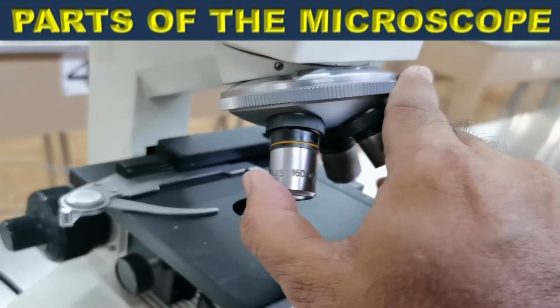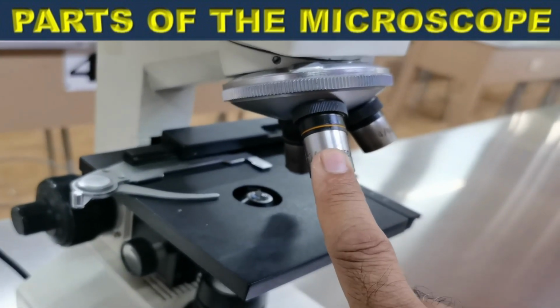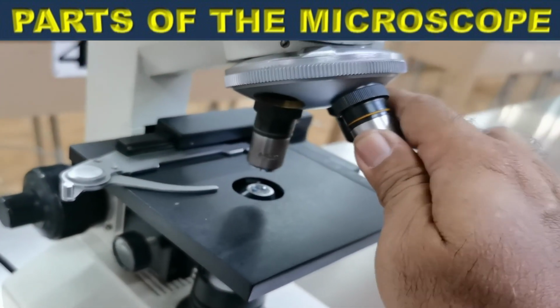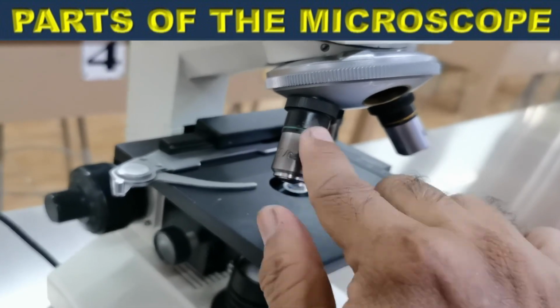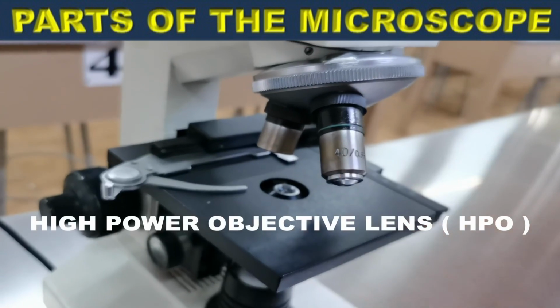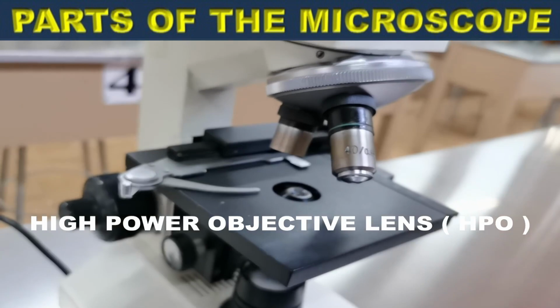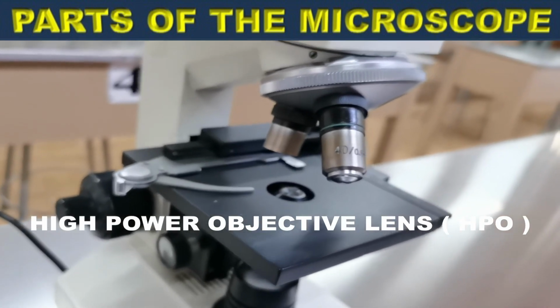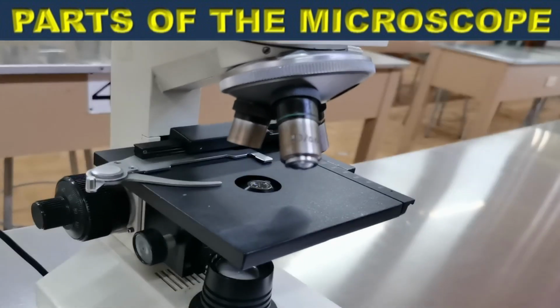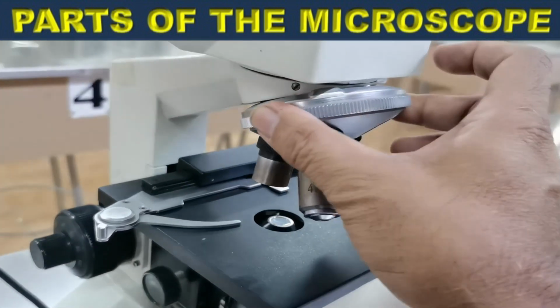This gives you more detailed images of your specimen. Now, if you want to magnify the image even further, then you can shift to this longer objective lens. This is the high power objective or HPO. The HPO gives you a higher magnification of the image of the specimen. So those are the objective lenses that are attached to the revolving nose piece.